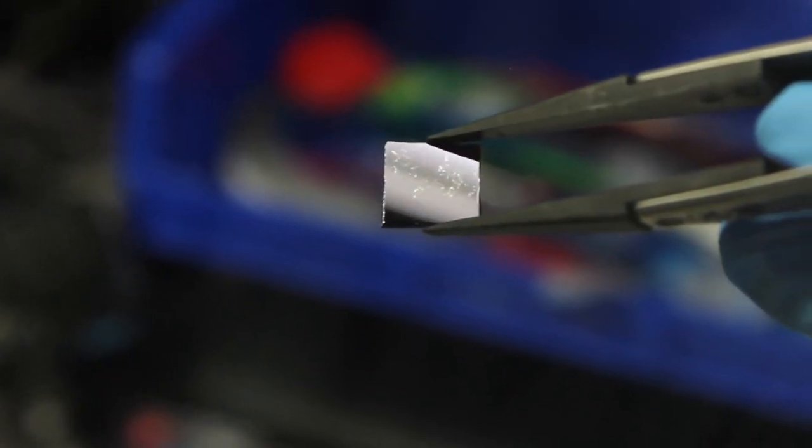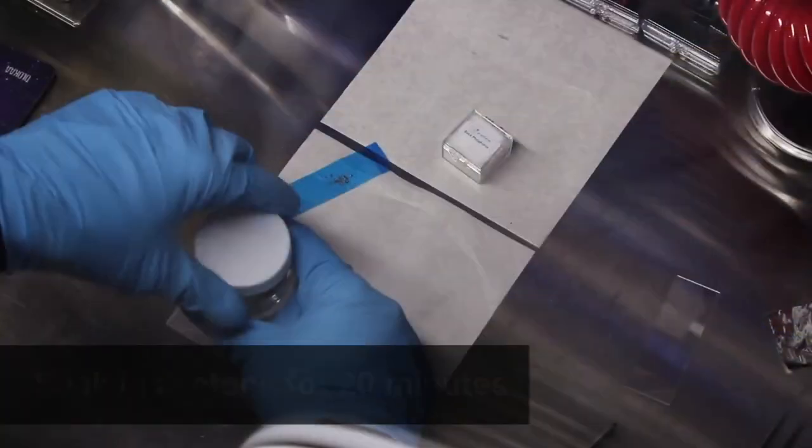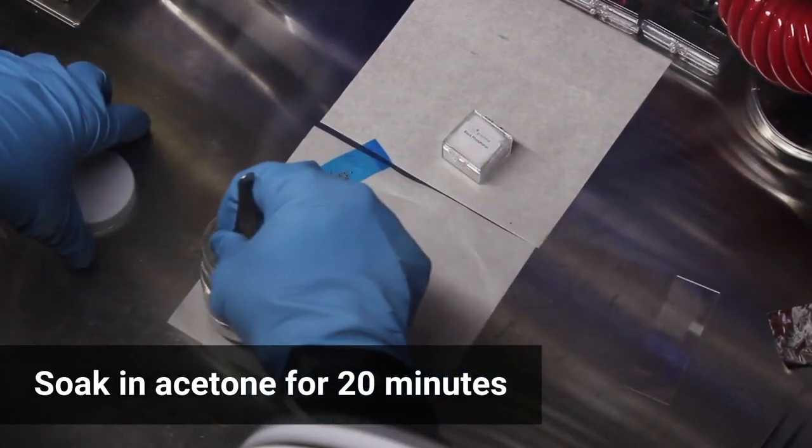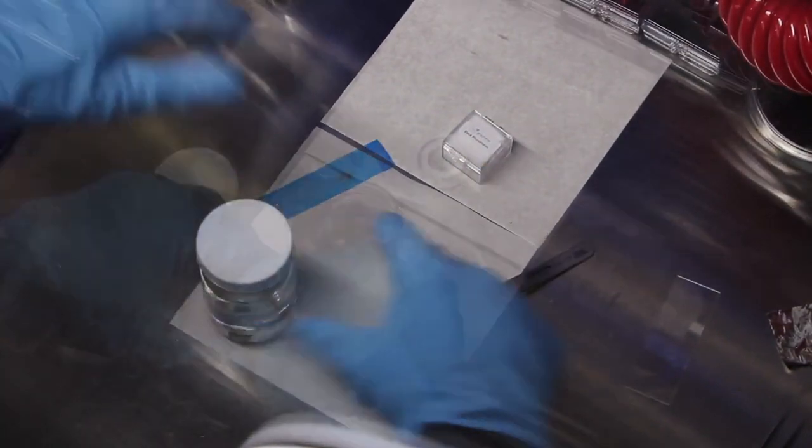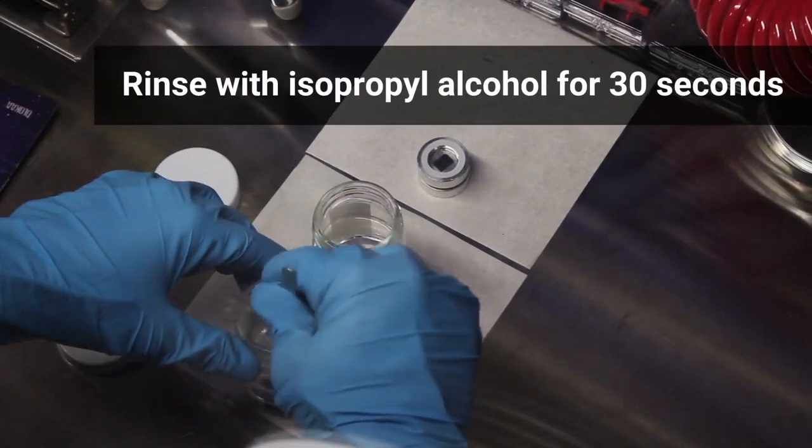Hot exfoliation will leave more tape residue than room temperature exfoliation, but most of the residue can be removed by soaking in acetone for 20 minutes, followed by 30 seconds in isopropyl alcohol.